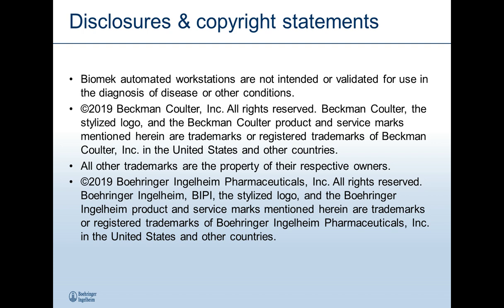For example, if you're using a 96 well plate and doing a 50 microliter ELISA, a small degree of evaporation is going to have a much larger effect than, say, if you were doing a 100 microliter ELISA or doing it with a 384 well plate. Much smaller available surface area for that evaporation to take place.